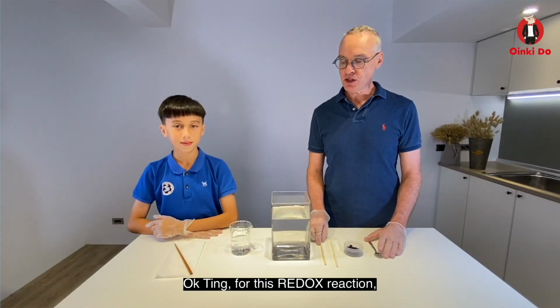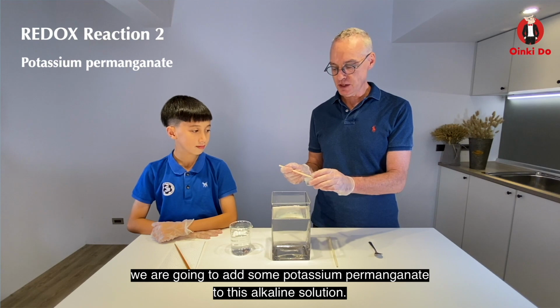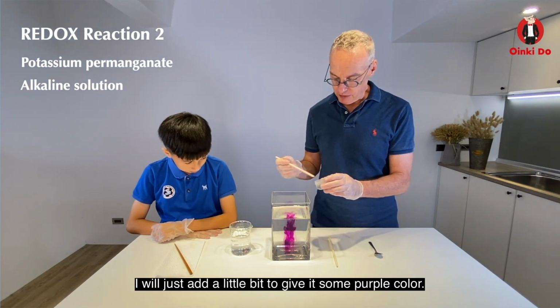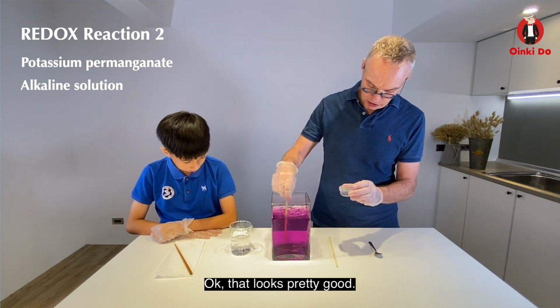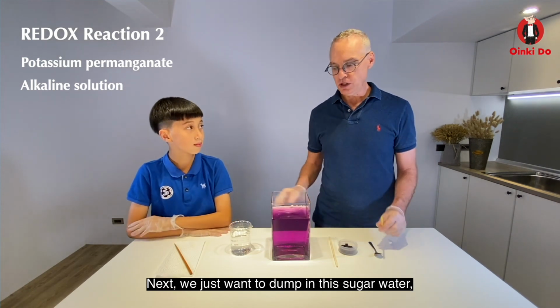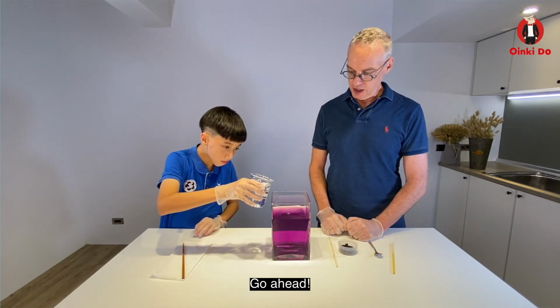Okay, Ting, for this redox reaction, we're going to add some potassium permanganate to this alkali solution. And I'll just add a little bit to try to give it some purple color. It's kind of pretty as it drops through there. Stir that around. Okay, that looks pretty good. We should be able to see some color change from that. So next, we just want to dump in this sugar water and see what kind of color changes we get. Go ahead.